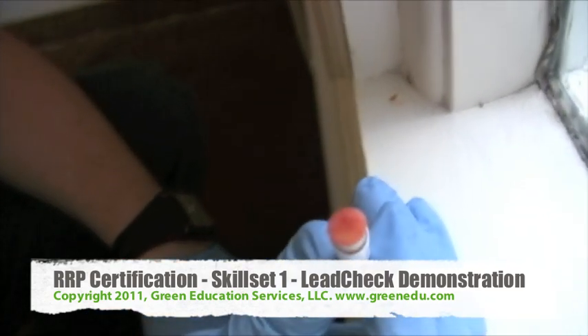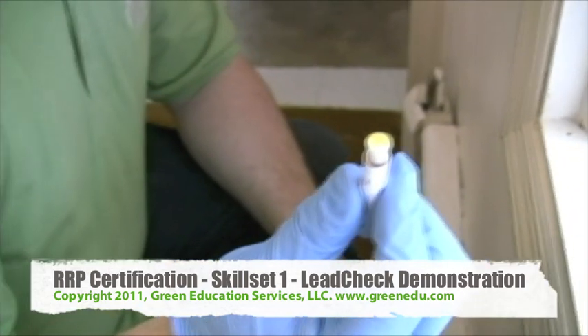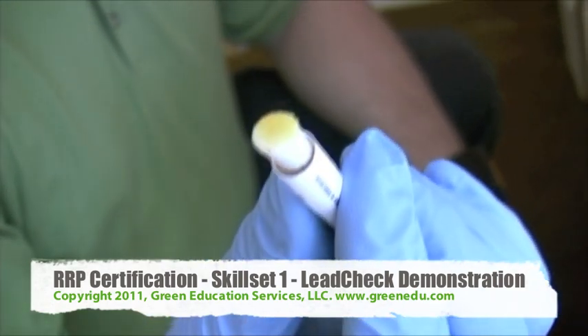If the swab tip and/or test surface turn pink or red, the test is positive. If the swab tip and/or test surface shows no pink or red color change, the test is negative. Lead is not detected in the test area.